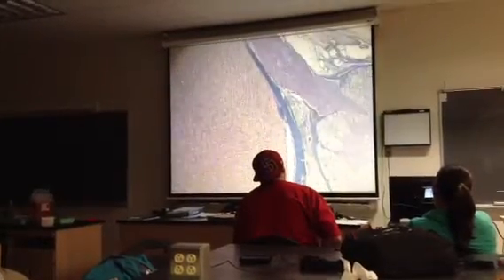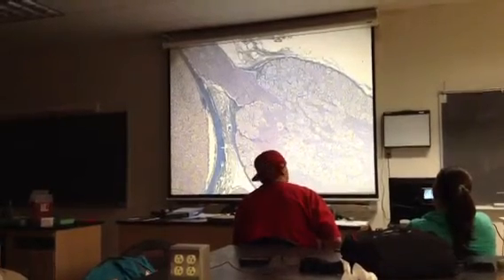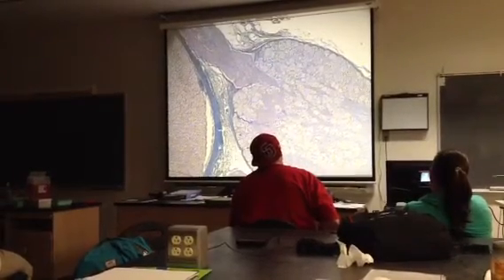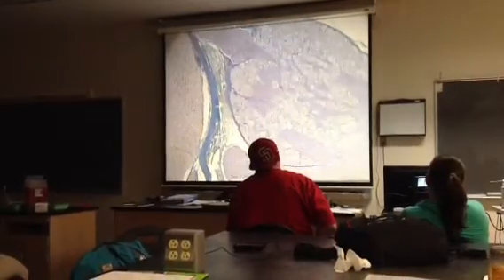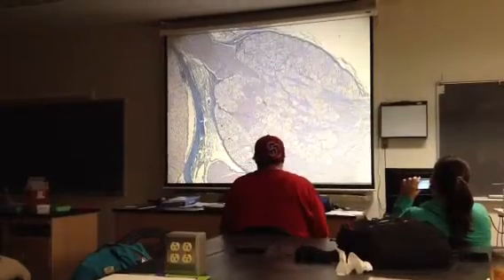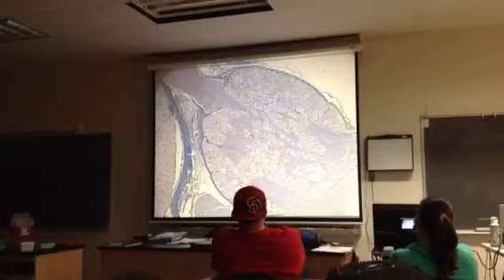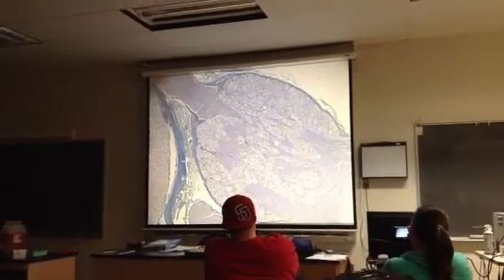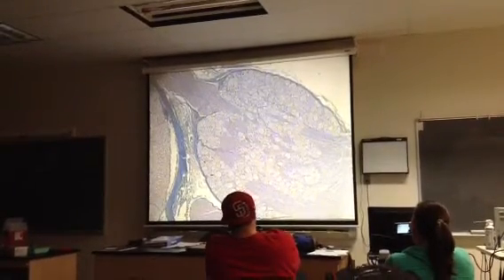Okay, and then that is going to be connected to the cell bodies. So this is what? What's this whole structure? The dorsal root ganglion. Yeah, that's the dorsal root ganglion. So that's a specific name for that ganglion. There's other ganglia in the body, other than just the dorsal root one. You have lots of these. This is called the dorsal root ganglion. And those are all the little somas. See, so that's the cell body of the neuron, and its axon is over here. Right? So it's connected.